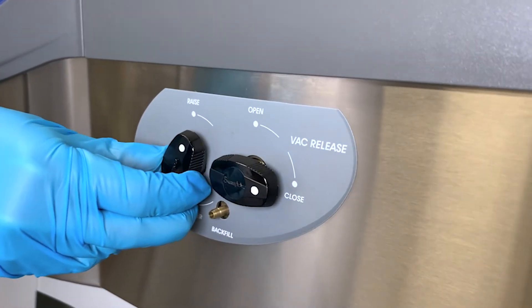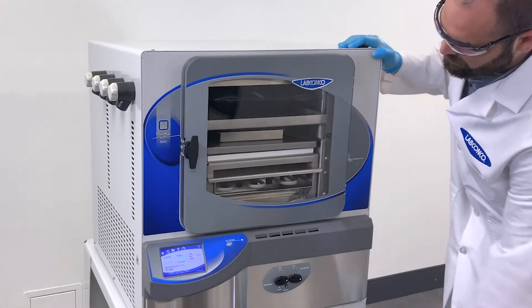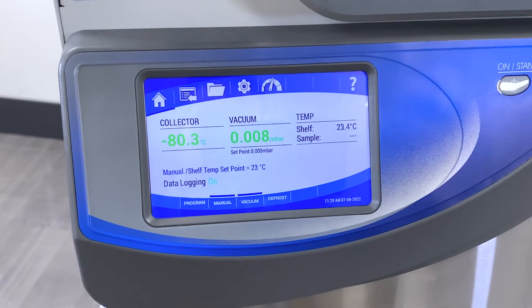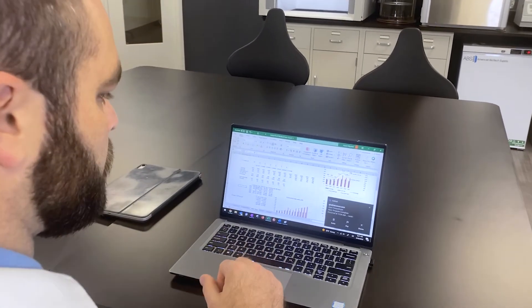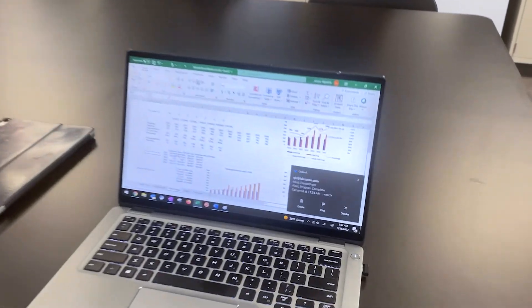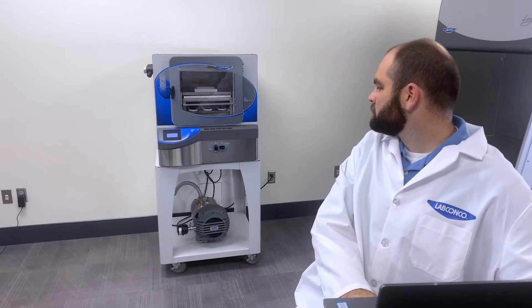Stopper vials in the chamber under vacuum without the need for compressed gas. The included Lioworks operating system offers real-time notifications that inform users of selected alerts and run parameters, freeing them to focus on other important tasks when they're not in the lab.